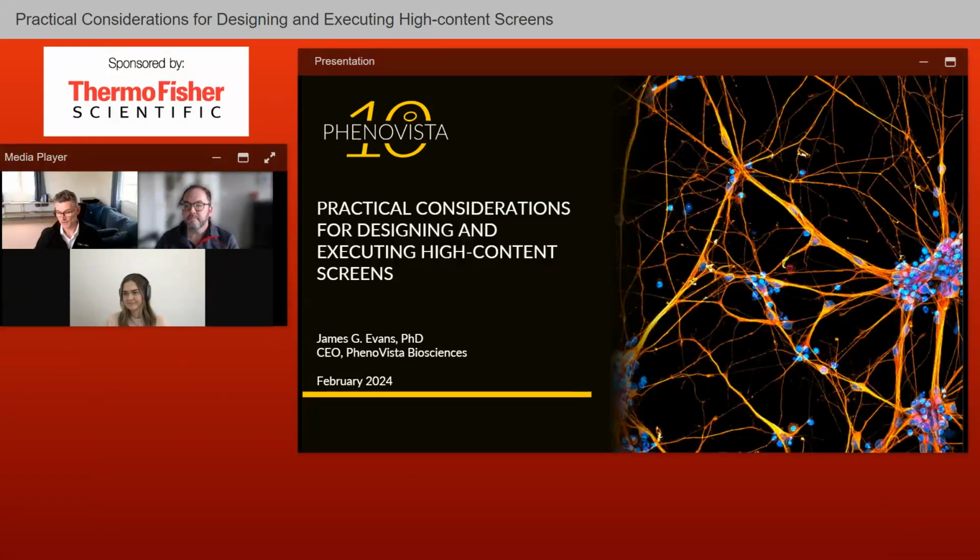You can go one step further and add in a third component like microglia and look at the neuroinflammation processes. These can be scaled from 2D to 3D as well, where you can look at calcium transients and excitatory events using FLIPR-based systems. That would be a relevant readout for function.